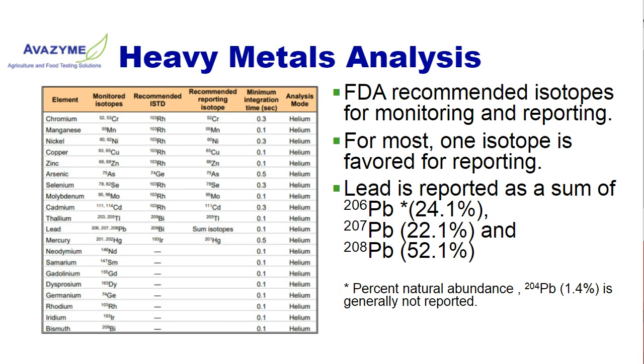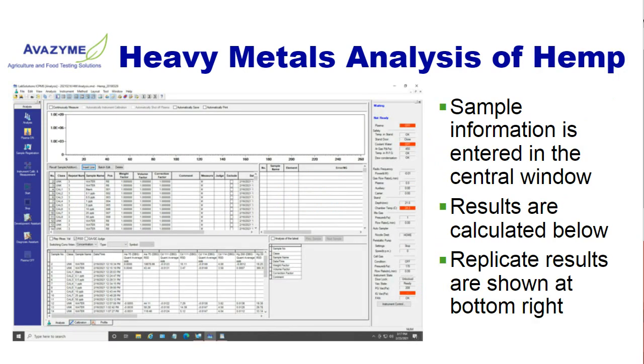Okay, and this slide shows a screenshot from the LabSolutions ICP-MS software. This is a layout of the acquisition mode with instrument controls and instrument status shown on the right-hand side. The center top frame is the spectrum being currently acquired. The center left frame is where you enter sample information.